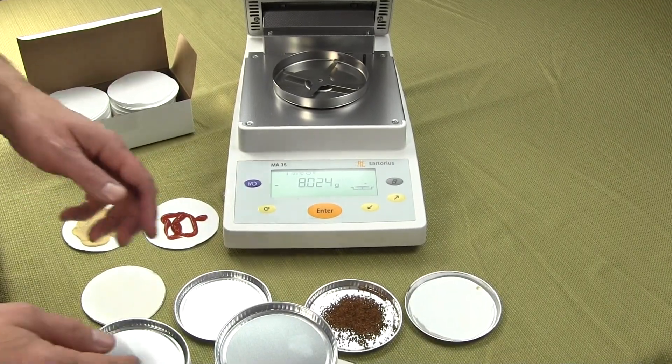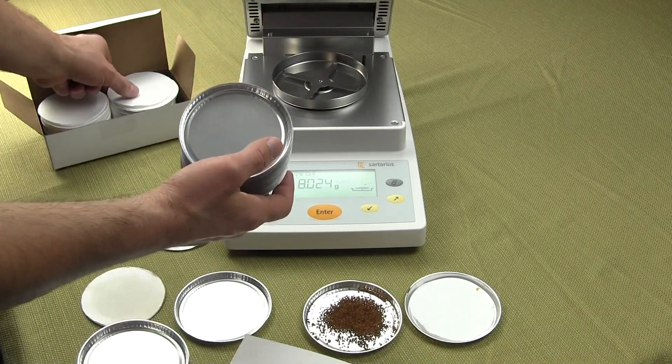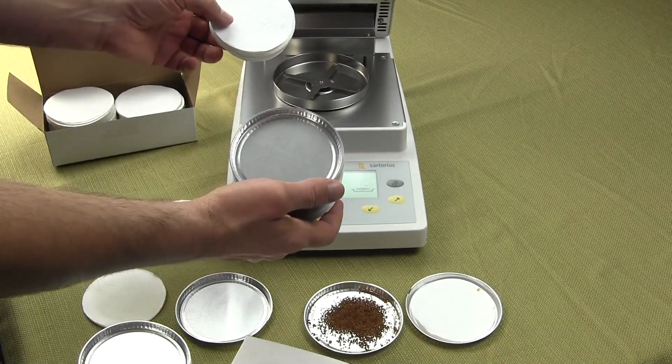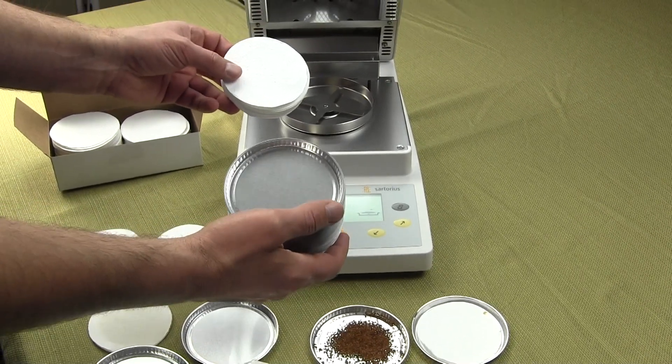Welcome to Precision Weighing Balances. Today we'd like to talk to you about the moisture pans and filter pads that we have to offer for some of the most popular moisture balances on the market.